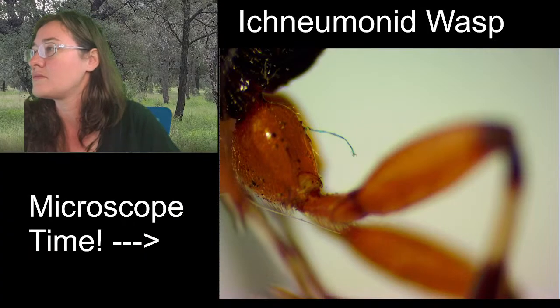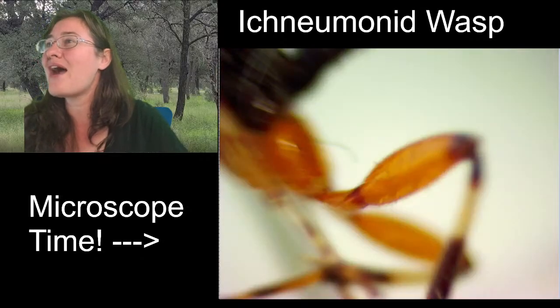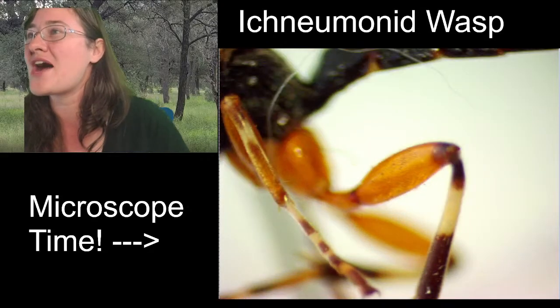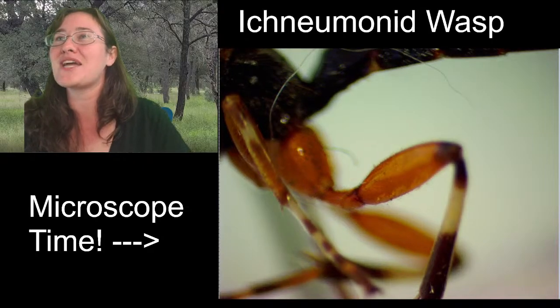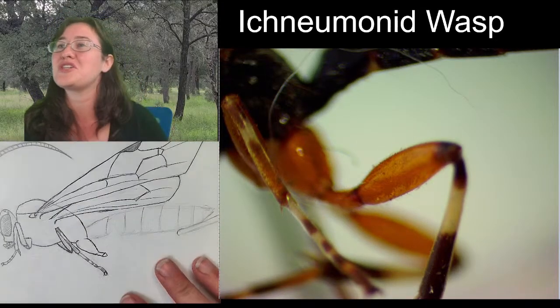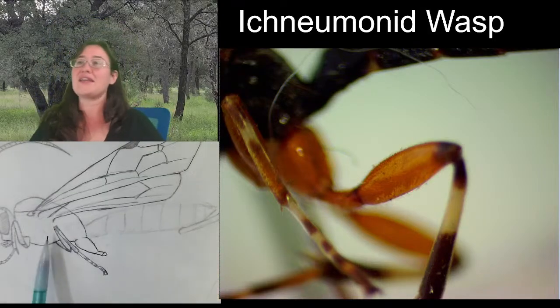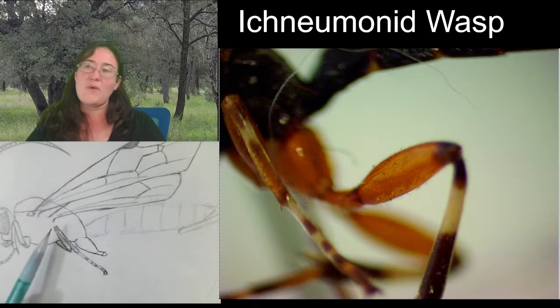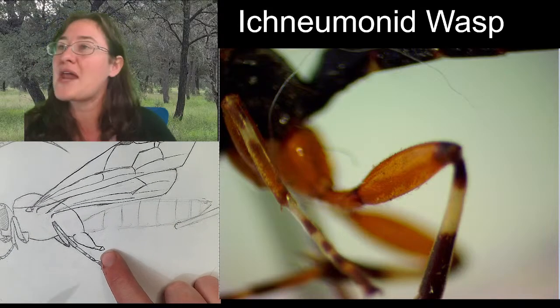Good morning, Chaos! We are sketching an ichneumon wasp today. And we actually spent a little bit of time checking out our wing venation too, which was pretty fun. So right now we are sketching the hind leg. We are on the metafemur coming out here.